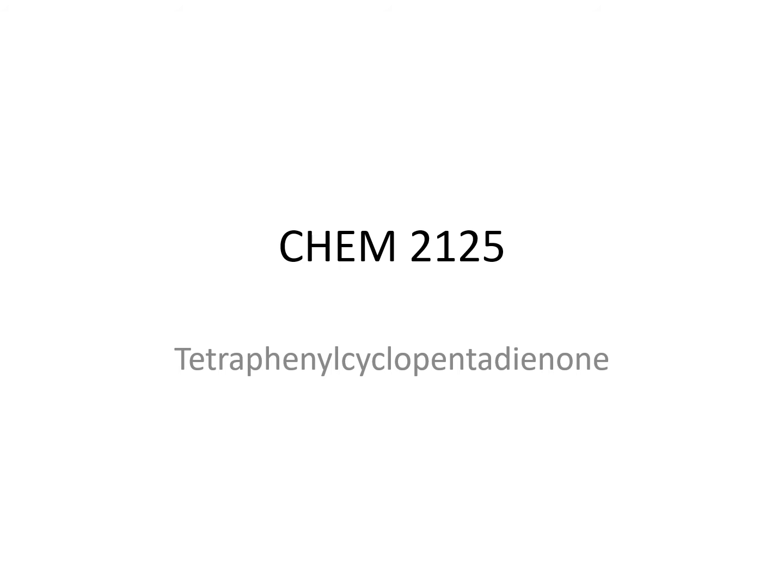Hello everyone, this is a lecture course for Organic Chemistry Laboratory. This week's lecture focuses on synthesis of tetraphenylcyclopentadienone.